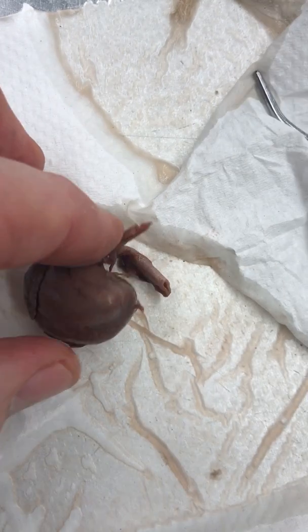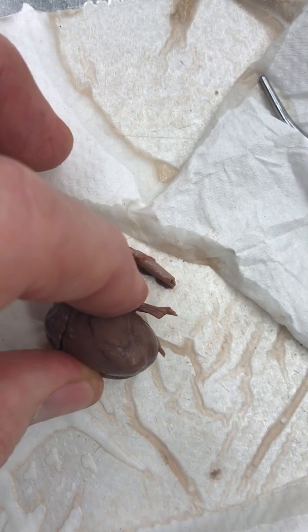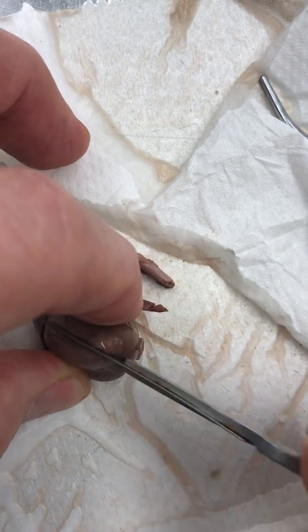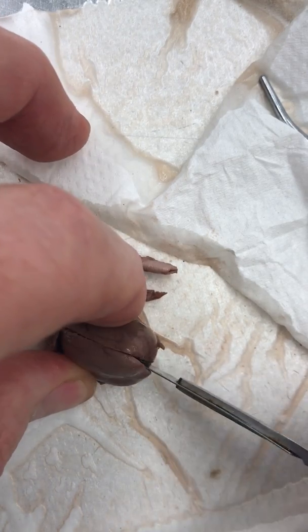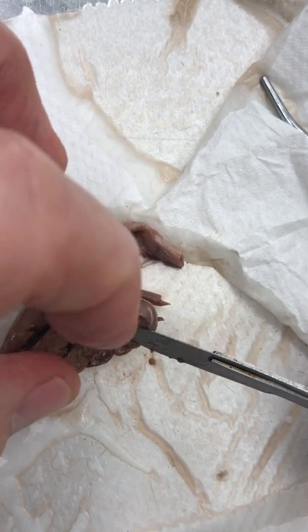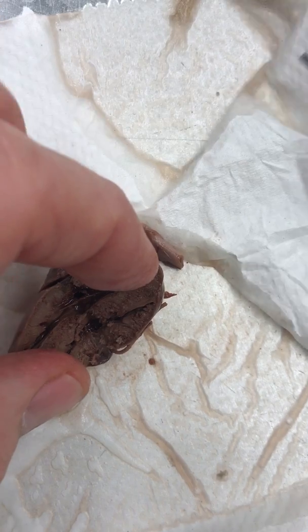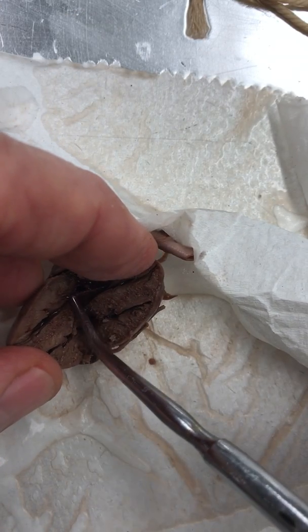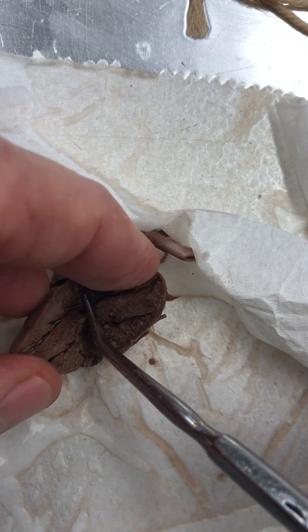If we cut this open, I don't know what that's going to look like. We're going to cut it open. So I'm cutting into the muscle of the heart. You can see the muscular walls of the ventricles. These are parts of the valves.